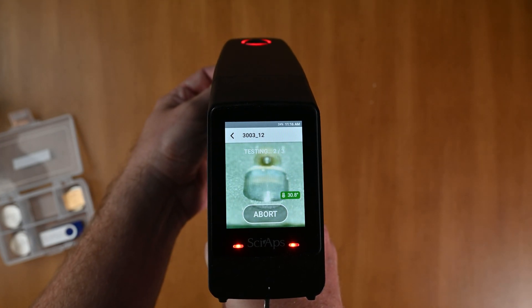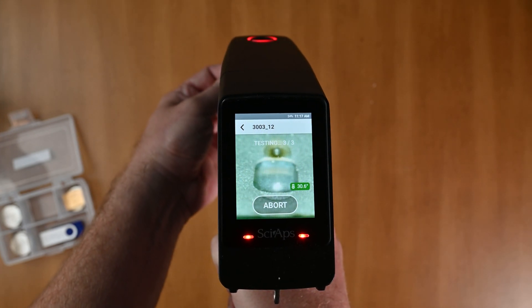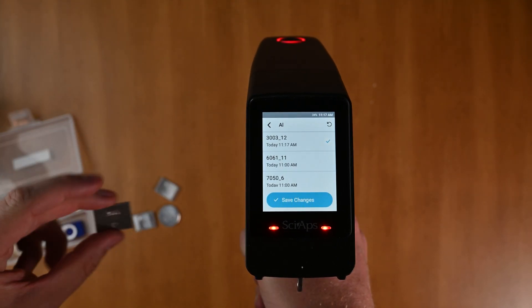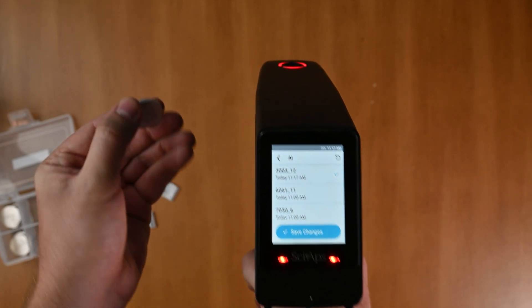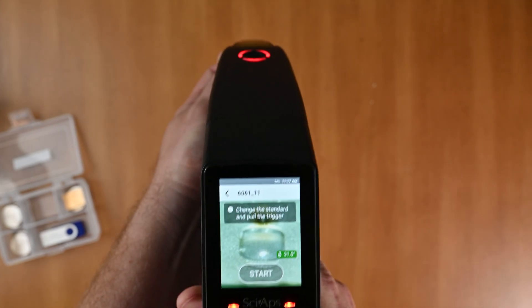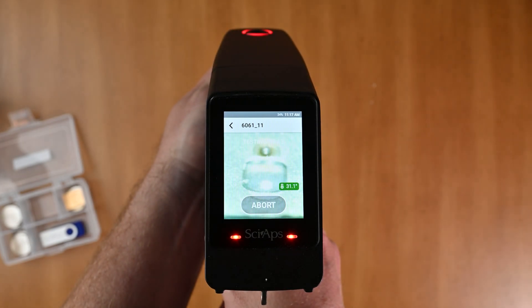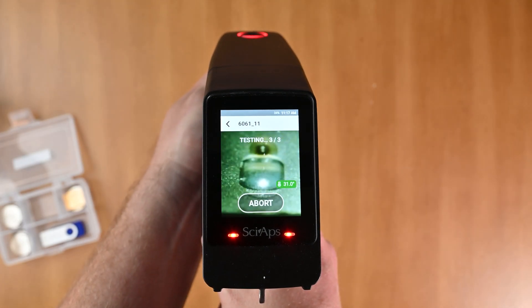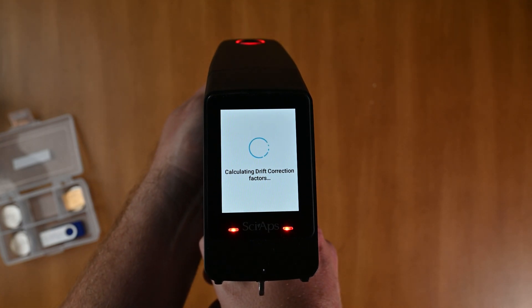It's going to do three different tests. Once that's done, you'll see the checkbox — we're all done with 3003. Now the next one on the list is 6061, so let's grab that coupon and put it in front of the analyzer. You're going to want to do drift correction anytime you run specific families of alloys — if you're out there running aluminum, run it in that environment, and also if the temperature changes significantly.